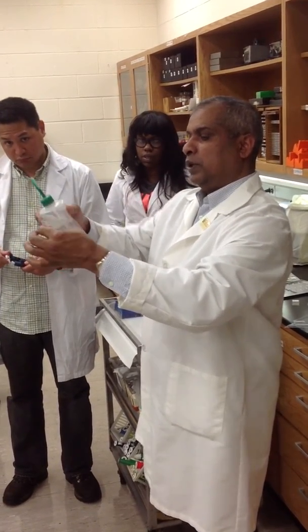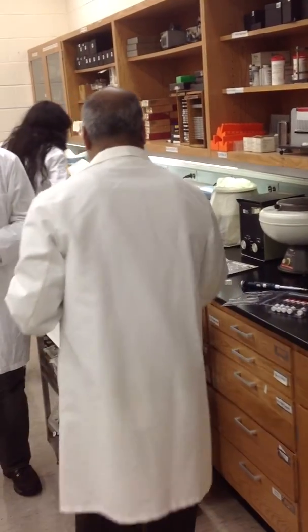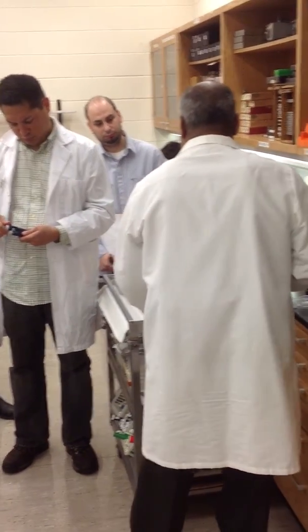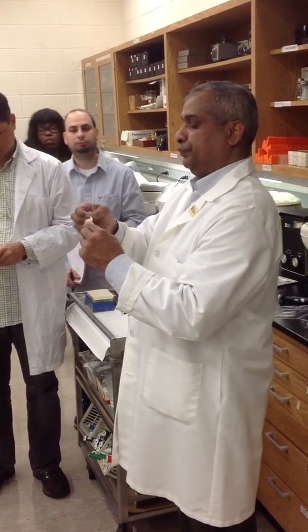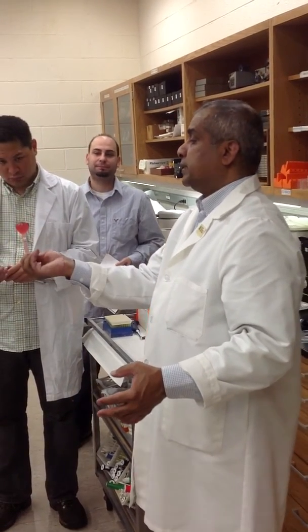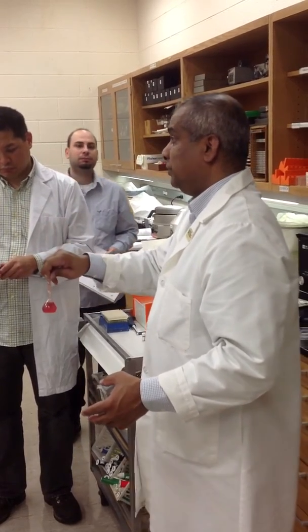It doesn't matter the measurement? Right. Okay. So we can mix this up. You can use a parafilm. We have parafilms, so we can seal this up. Make sure it's not leaking, and then you can make sure this is mixed correctly. Now when you take from this, you're going to make sure it's mixed also.